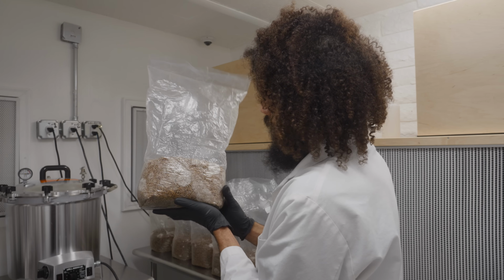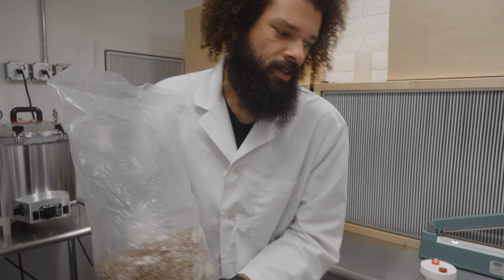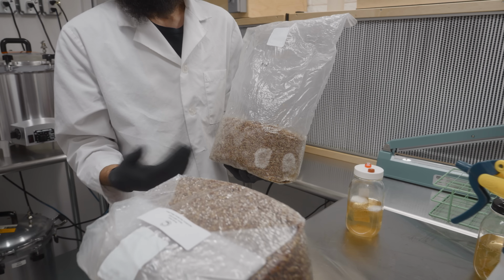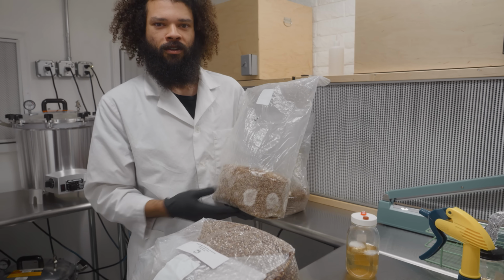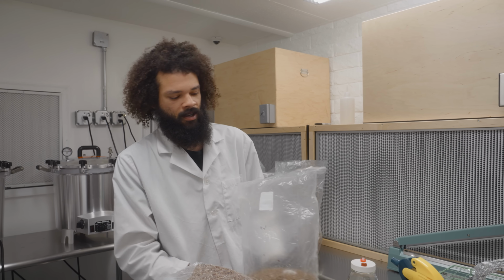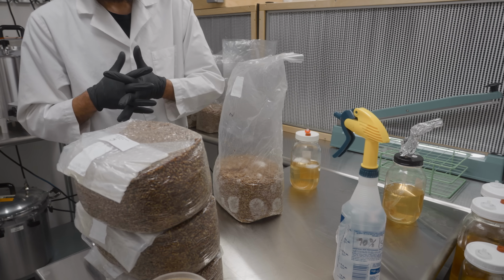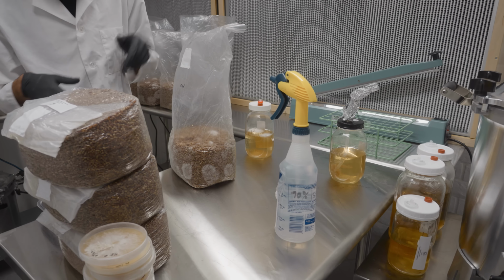But yeah, this bag will get broken up into 10 new bags. So one petri dish becomes 20 bags. Those 20 bags can become 200. Each bag can be utilized to inoculate 20 to 50 production blocks. So that 200 can become quite a bit of mushrooms, 200 spawn bags.